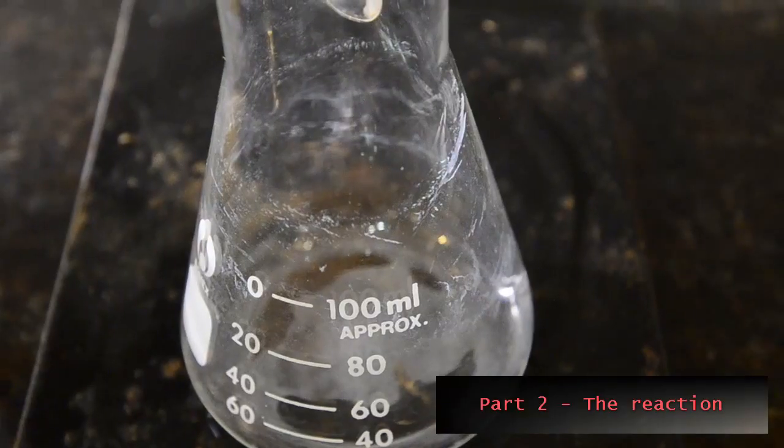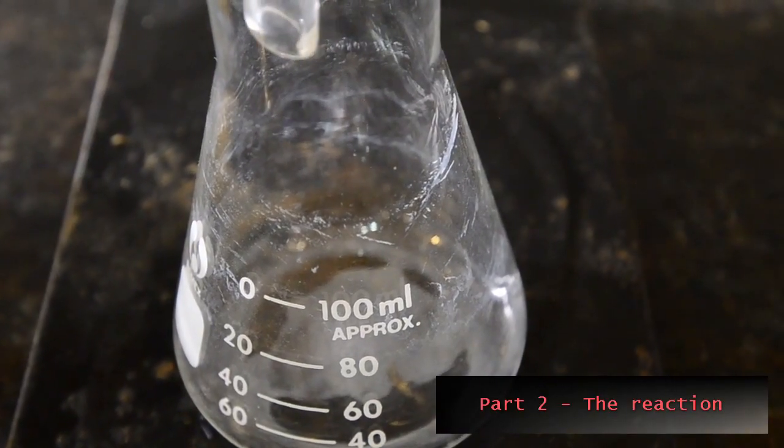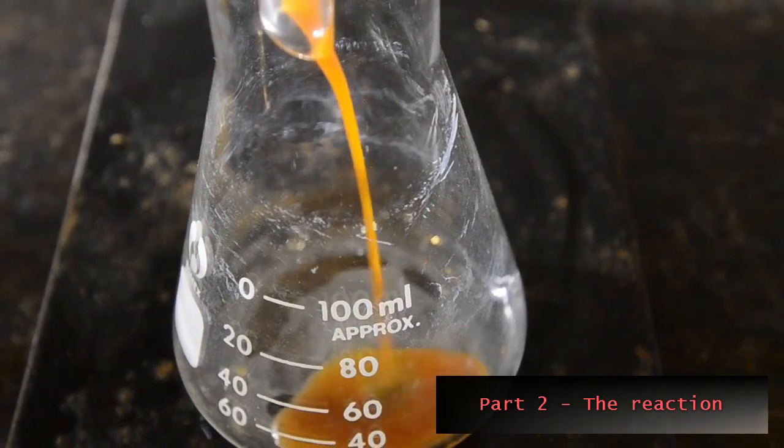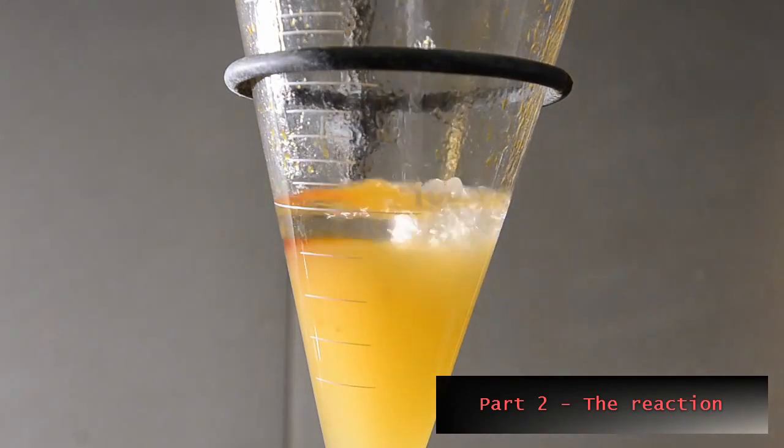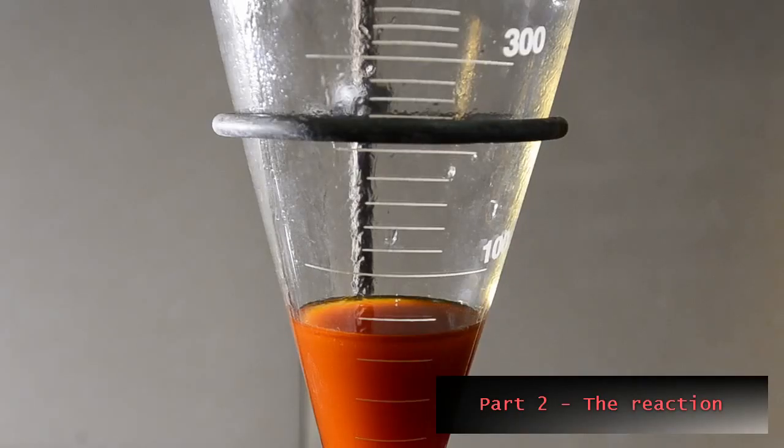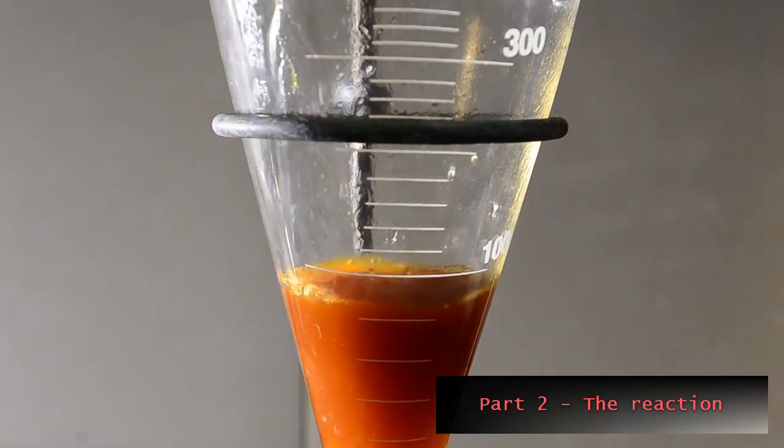Place the aqueous layer back into the funnel and then wash this with 50 milliliters of toluene. This will extract out any dissolved mandelonitrile. Separate the toluene layer and carefully dispose of the aqueous layer containing cyanide.